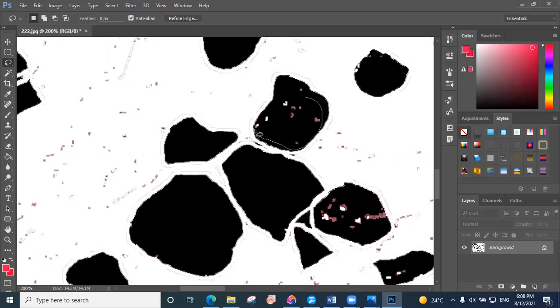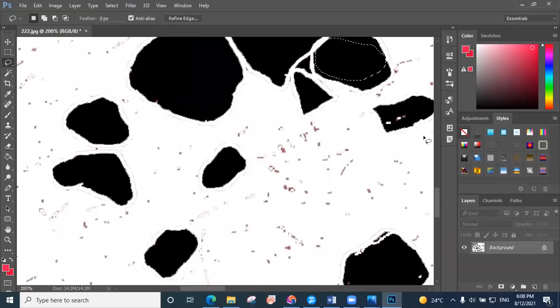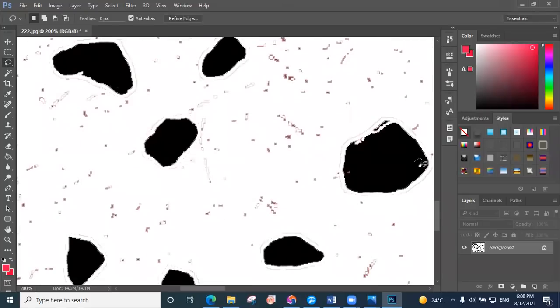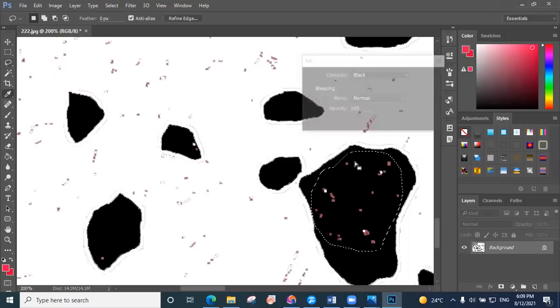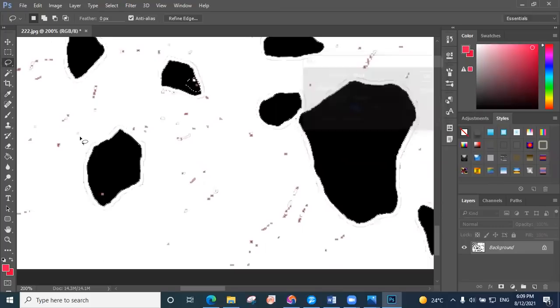It will be easier and faster. So it's better to use black and white images. This method solves any problem you could face when you are calculating the microstructure grain size.